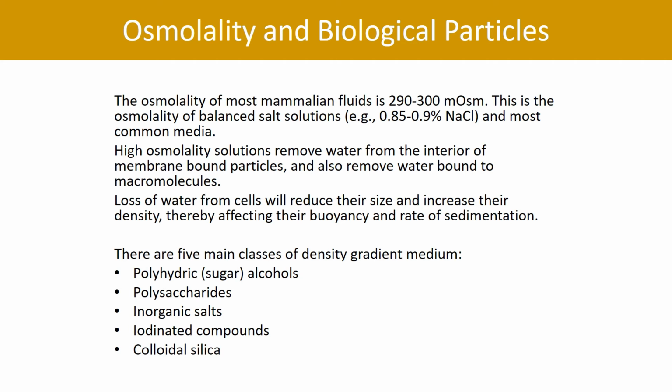So the osmotic effect on a cell and macromolecules, we can reverse it. But the error that it is causing in sedimentation cannot be reversed. Therefore, you have to think about it.